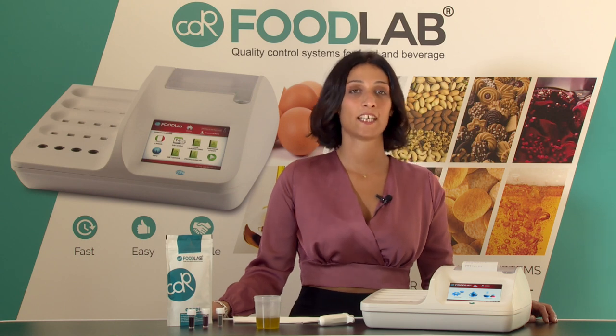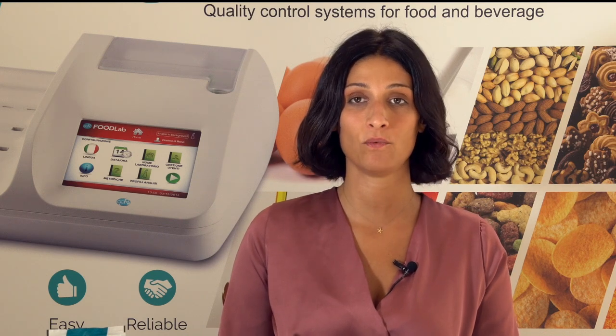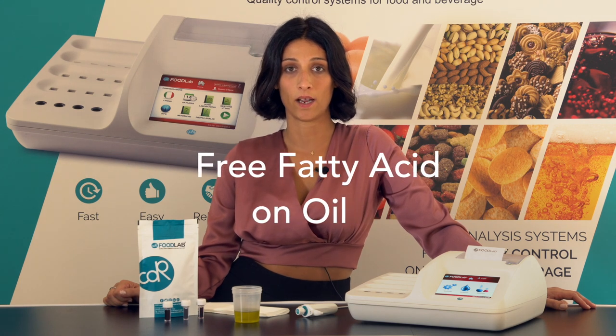Hi, this is Giulia Chiarion from CDR and I will show you how it's so fast and simple to perform a test with CDR Food Lab. I'm going to make the test of free fatty acid in oil.